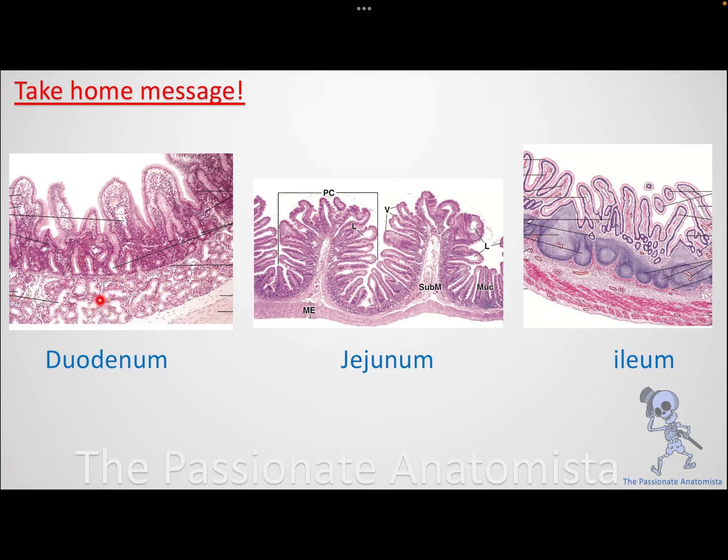If you get to see glands, they are losing their content because they are mucosal glands and they have mucus secretion, so they look like flowers or cells that are losing their content, empty content here. Okay, because here there was mucus and we lost it during preparation. This is duodenum. If you look and find a very thin submucosa without anything other than the basic components of any submucosa of any connective tissue, this is going to be your jejunum. And if you see the Peyer's patches, it means these are the ileum.